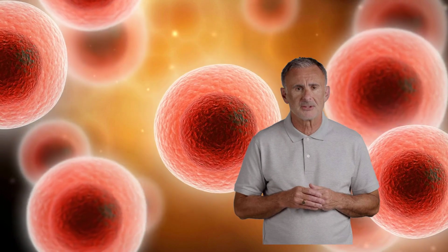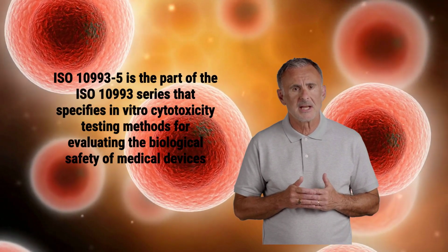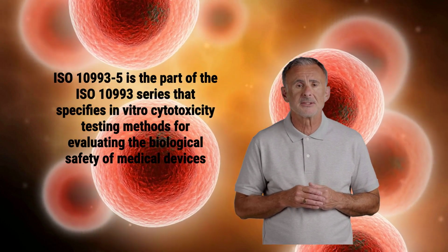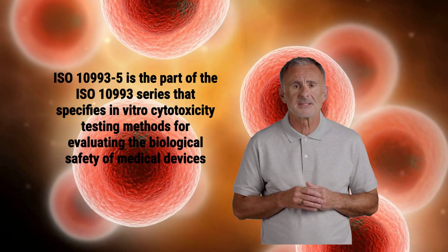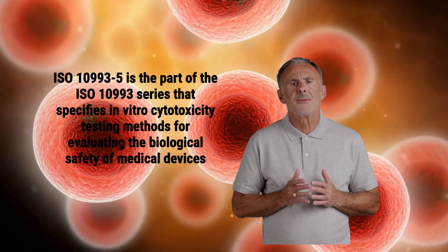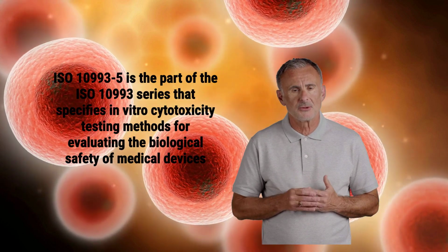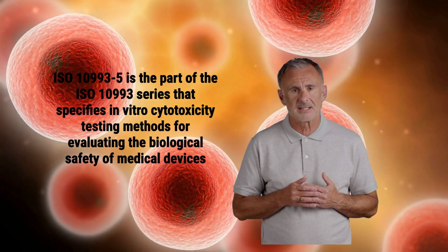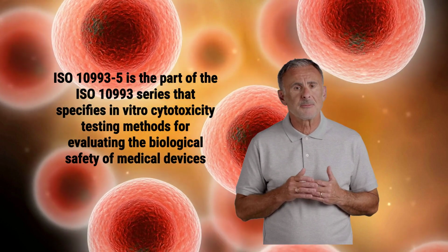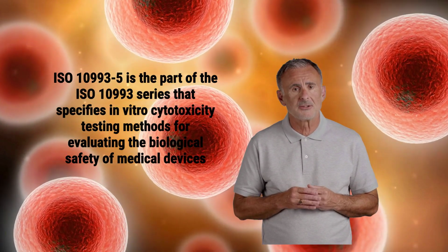Now that you have an overview of cytotoxicity testing, you can find further information in ISO 10993-5, which outlines standardized methods to assess whether a medical device or its materials harm cultured cells. It describes direct contact, indirect contact, and extract approaches, evaluating cell viability, morphology, growth rates, and membrane integrity using assays such as MTT, LDH release, or neutral red uptake. This testing is widely required by regulators, including the FDA and authorities in Europe.